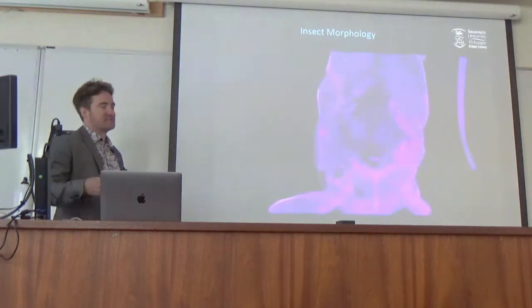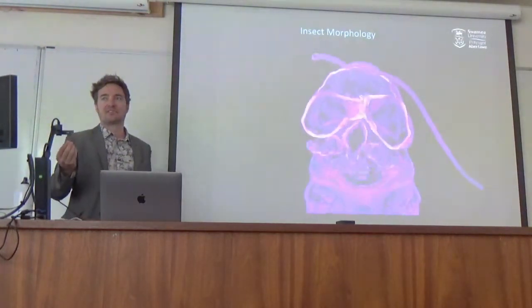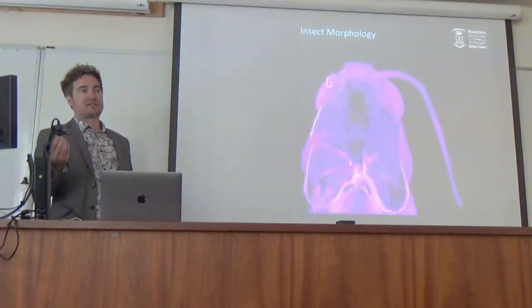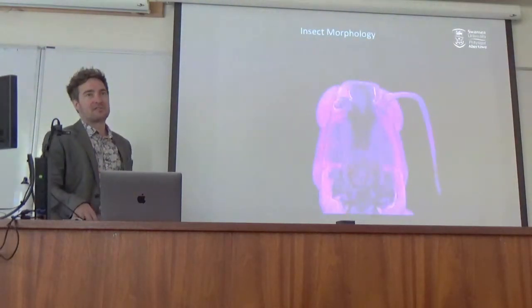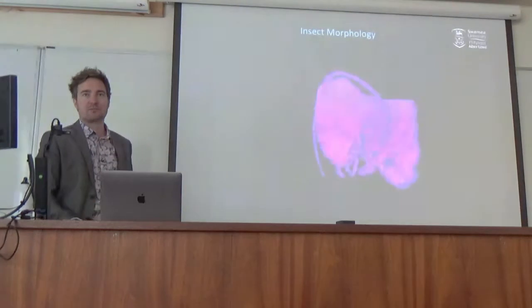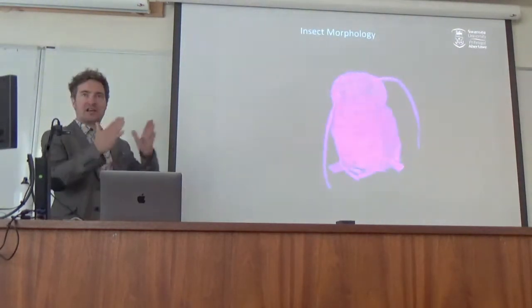We did a study on different staining and different fixing agents. If you have live tissue, soft tissue, we need to fix it so it doesn't degrade and then stain it afterwards. So this was a project working with someone who'd seen some of our visualizations before and wanted to look at the effect of different fixatives and shrinkage.